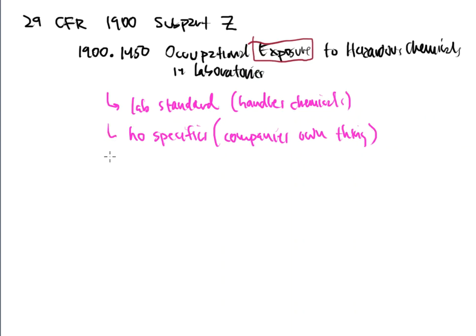Under this subpart, we also see what we call a Chemical Hygiene Plan. This is basically a document that all laboratories should have. And the Chemical Hygiene Plan is basically a book of paperwork, and the new employees go through this book, go through the paperwork. They kind of read. Some of them take assignments. Some of them take quizzes. Some take a training initiative as part of their hiring package. But the Chemical Hygiene Plan should be kind of integrated in that training.